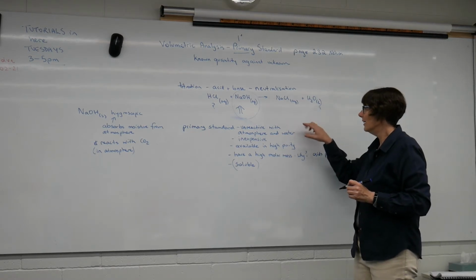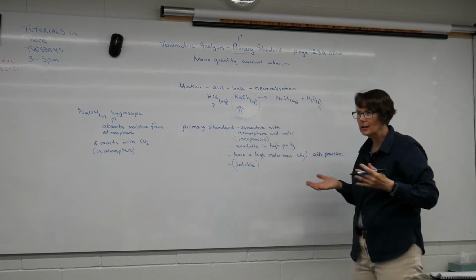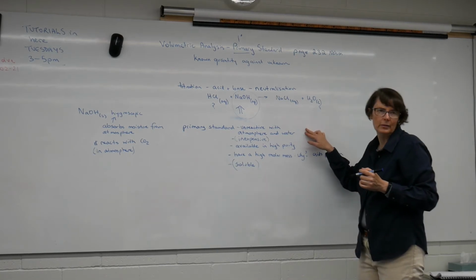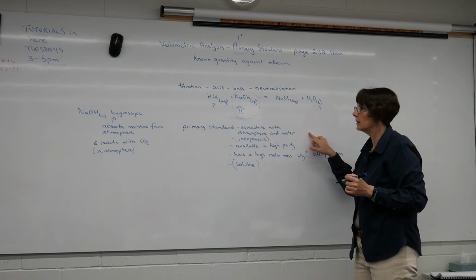I would rather you be focusing in on, even this one, yes, it's true and it's important, but the really critical factor is whether it's unreactive with the water in the atmosphere.